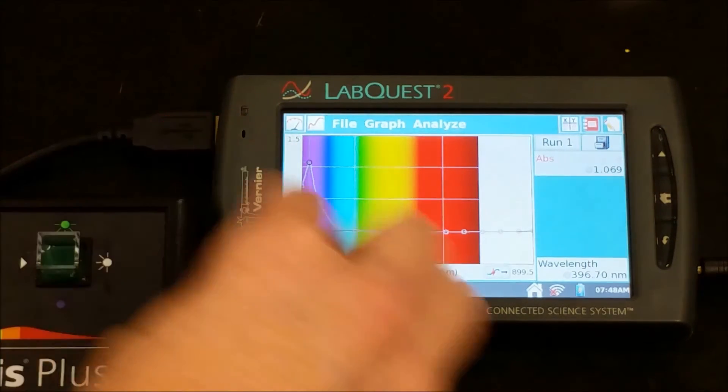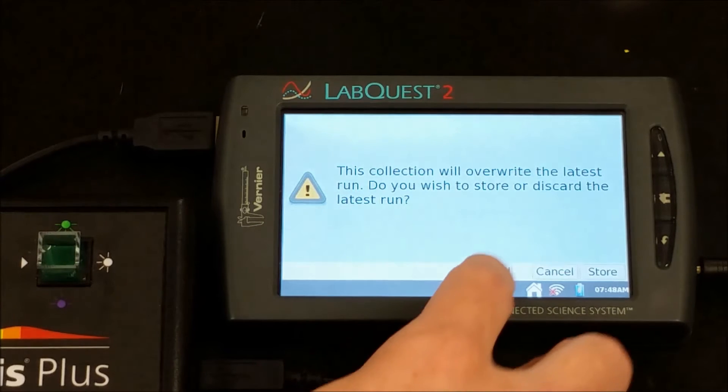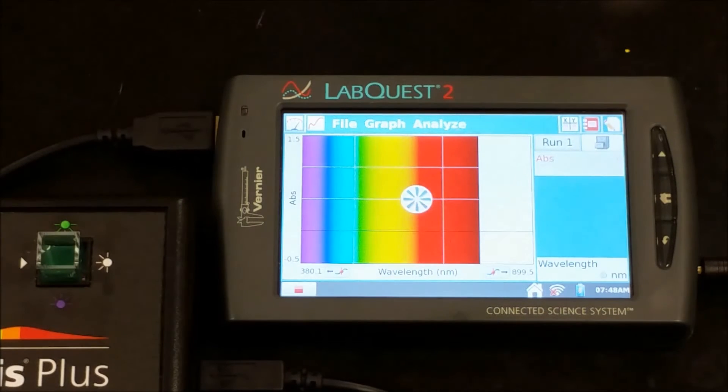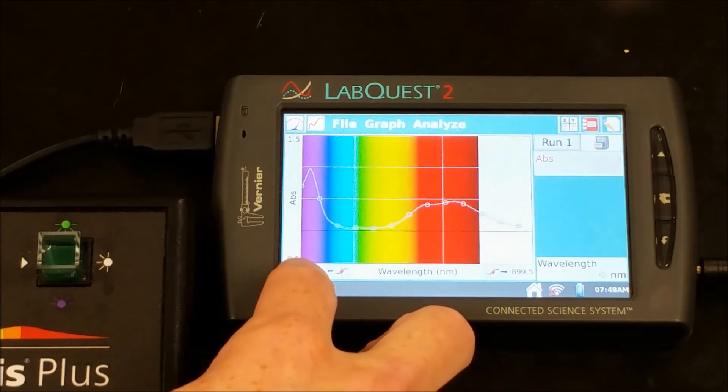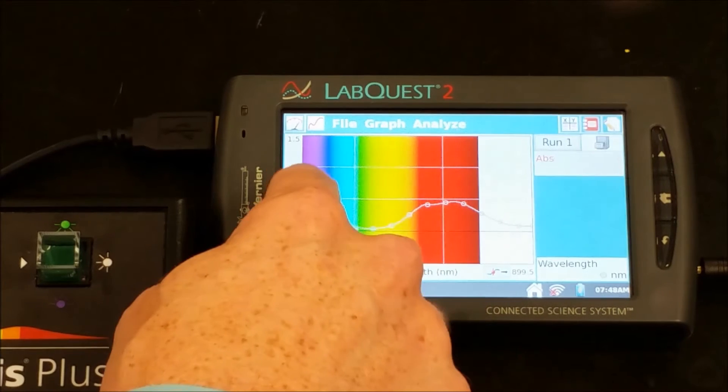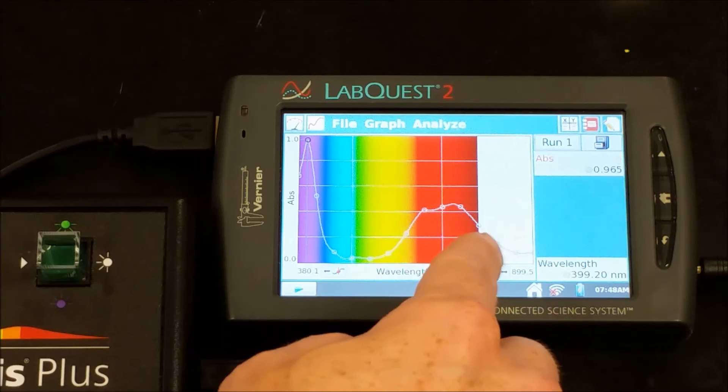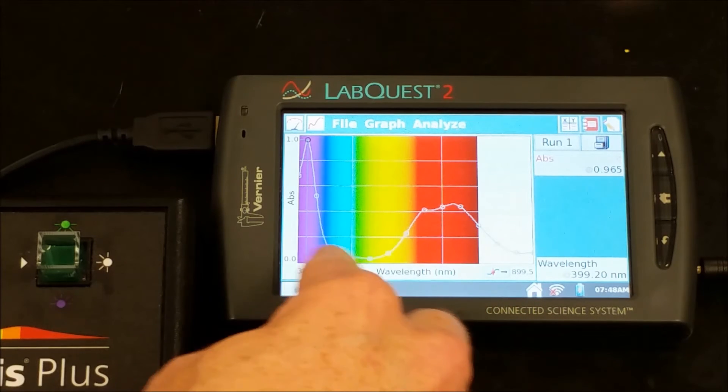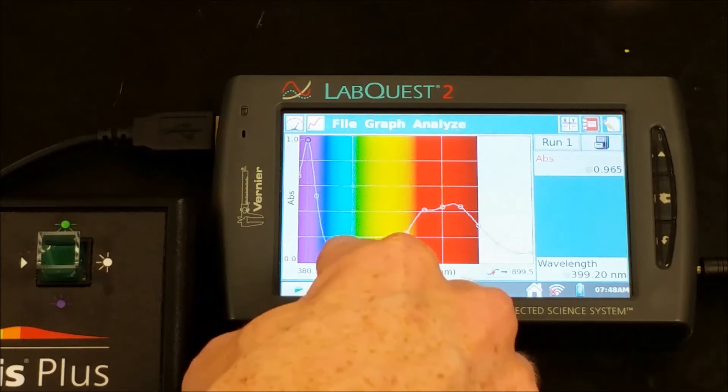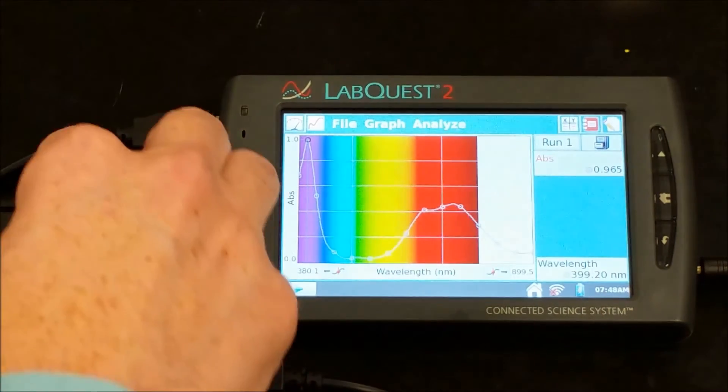We'll do green next. For green, we see some purple being absorbed, and we see some red into the orange region also being absorbed. We're seeing green transmitted, maybe a little blue, a little yellow, and then the other colors on the ends are being absorbed.